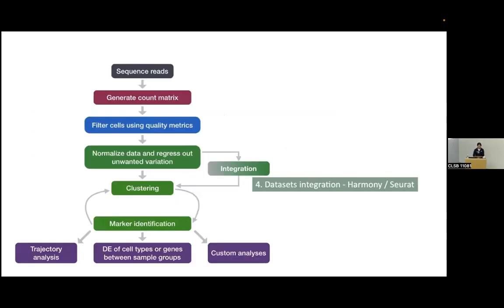So, okay, I'm gonna move on to a more generic step. That's data integration using Harmony and Seurat.